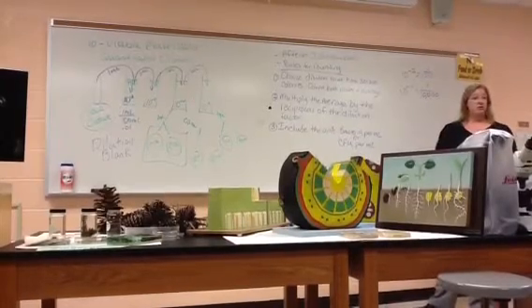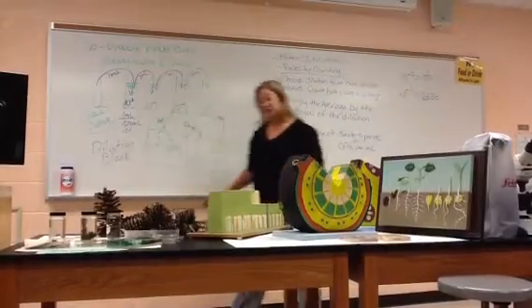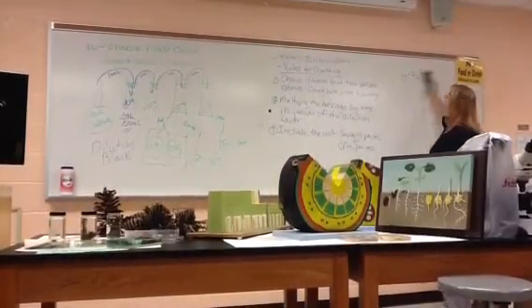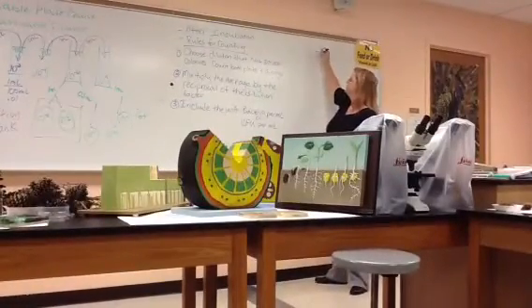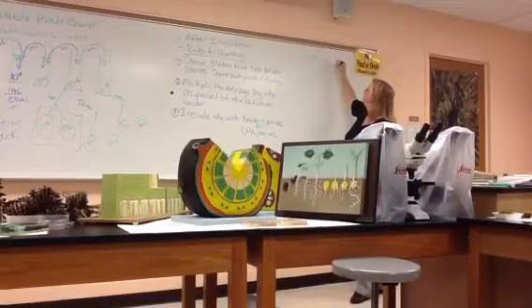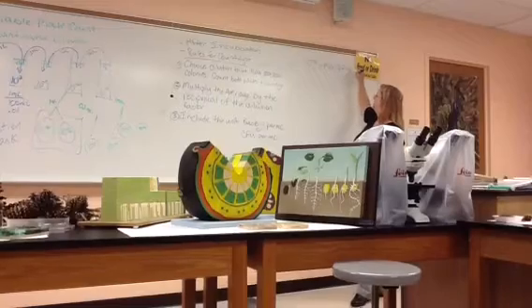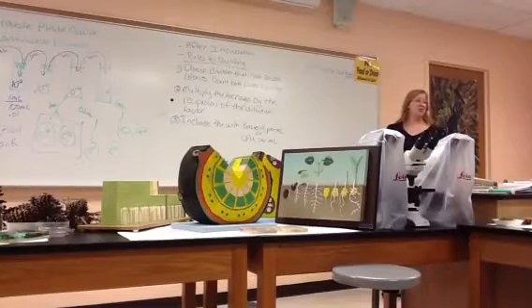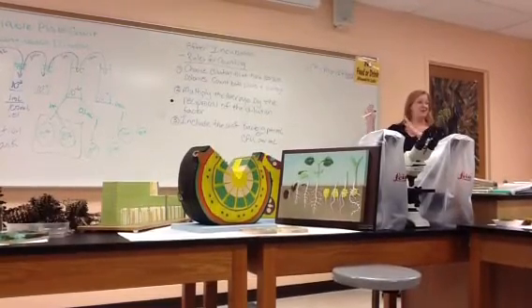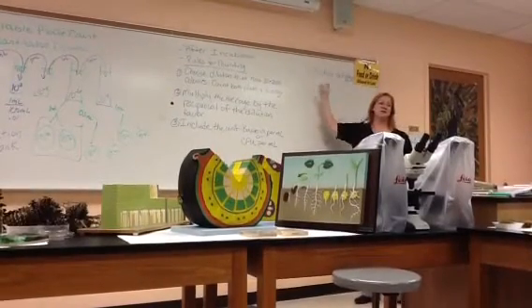All right, so let's say that you were to do that. Let's do a practice one here, because this is what your quiz question usually looks like, and actually, your lab practical exam question 2. The student in lab did a viable plate count. They counted the 10 to the minus 6 dilution, and they found an average of 167 bacterial colonies. On a practical, you don't have time to count 167, right? So I'll give you the number. Somebody counted for you. They got an average of 167 colonies on the 10 to the minus 6 plate.